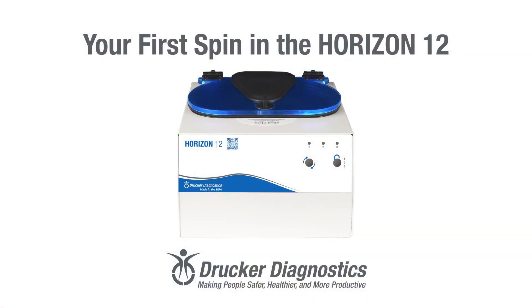Hi, I'm Dawn with Drucker Diagnostics, and today we're going to spin our first samples in the Horizon 12. Your first spin in the Horizon 12 — your Horizon 12 is set up, and now we're ready for our first spin.